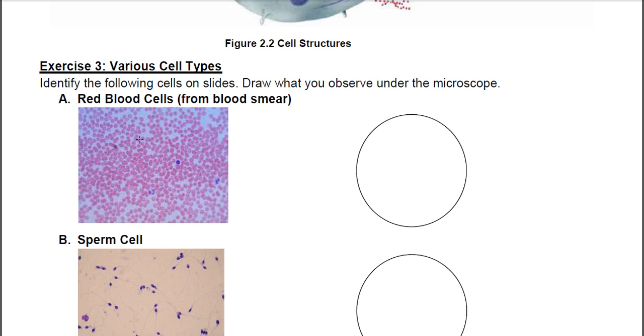First are the red blood cells. The red blood cells are these pinkish ones where there's a whole lot of them. These bluish colored ones are white blood cells. We're not looking at those on this particular slide. We're looking at the red blood cells. Obviously these are located in our bloodstream. Their main function is to carry oxygen. The special feature for the red blood cells is that they are a flat shape, almost like a donut where the hole didn't go all the way through. Also, red blood cells don't have a nucleus. There are only a few types of cells in your body that don't have a nucleus. Red blood cells are one of them.